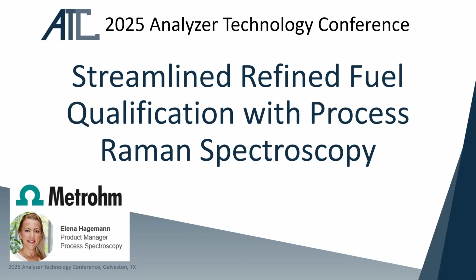Thank you, Elena, for the opportunity to speak this morning. First of all, I really appreciate the time that I can present process spectroscopy. It's probably well known to some of you and brand new to some others. So I hope that in this presentation you get something, even if you already know process spectroscopy. And since we are in Galveston, beautiful Texas, my presentation is around gasoline applications, but the principles that I present can also be applied to solvents, chemicals, polymers, food and food industry. Spectroscopy is not specific to a product, an application, or an industry field.